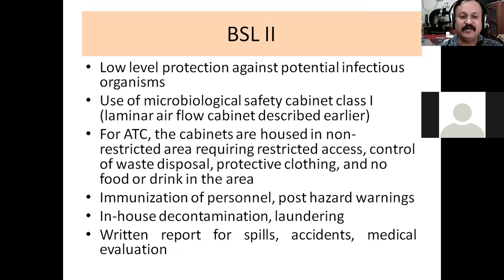If there are any spillages or small accidents, then there should be written reports. Everything should be reported to the higher authority. The authority should know that some problem had taken place, because if it leads to some other problem, if there are infections spreading, then the authorities should know why that happened. Therefore there should be written reports about every spillage which may take place in that biosafety level. Is it clear to everybody?